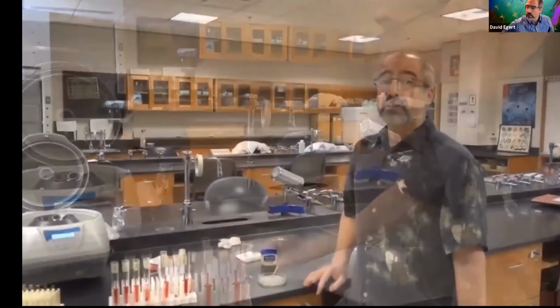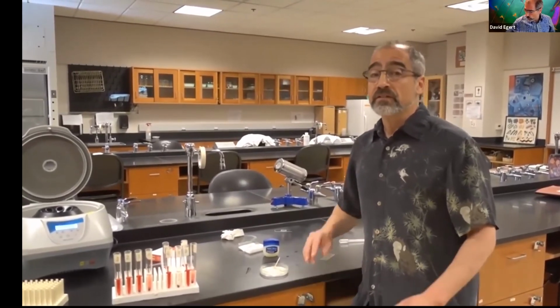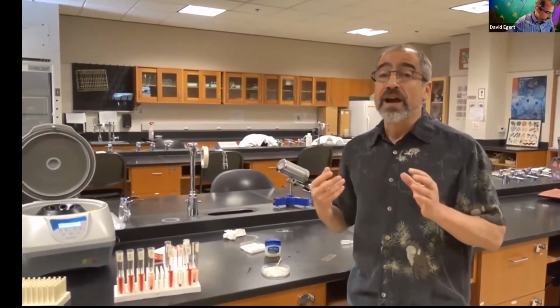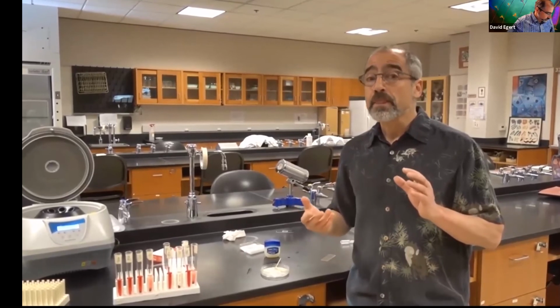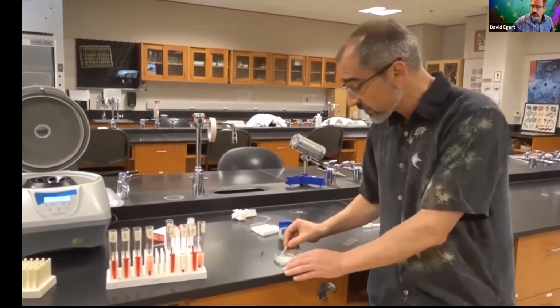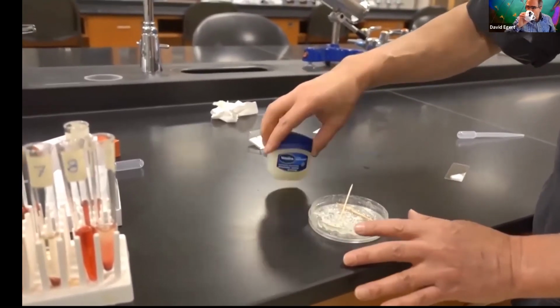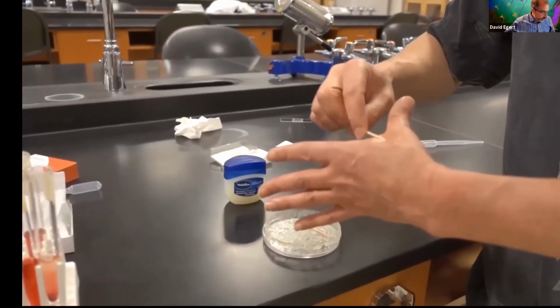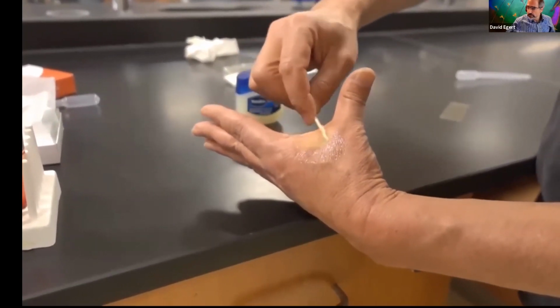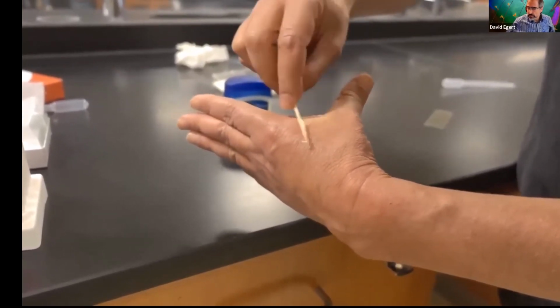To make a wet mount of the blood to see what happened to it, we want to make it so the cover slip is sealed, so the water doesn't evaporate from the solution if it just sits there. There's a nice little technique to make a sealed wet mount using Vaseline. This is just regular old petroleum jelly, Vaseline. You take a bit and you make a thin layer across this webbing between your thumb and your forefinger. It should be thin but present.